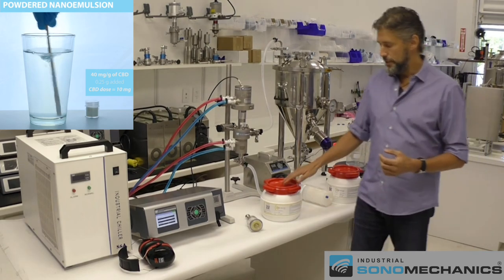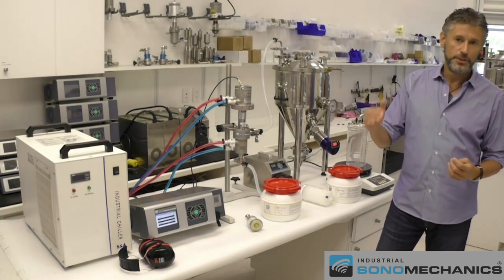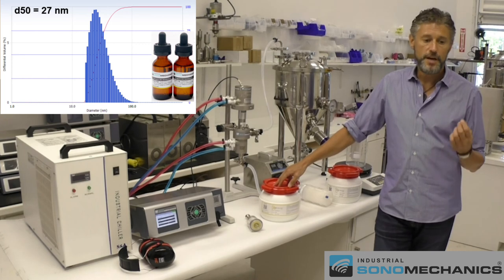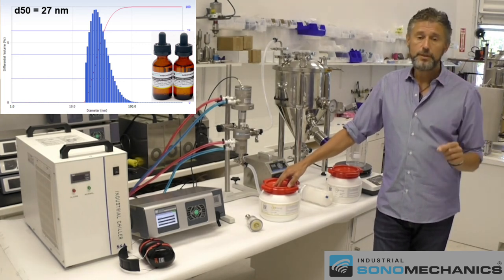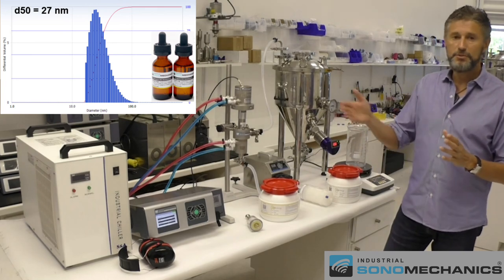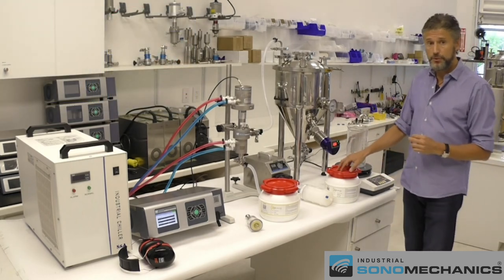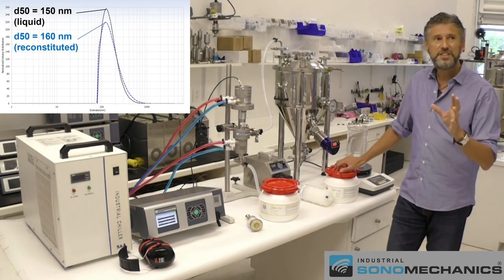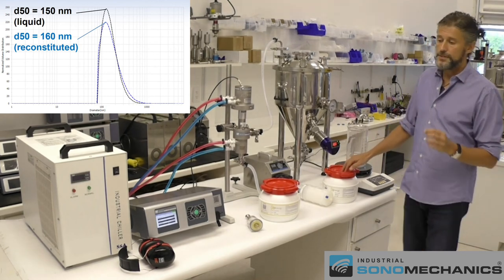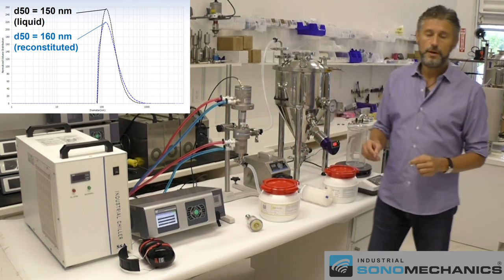It's also important to mention droplet sizes, as this is the main parameter that speaks to a nanoemulsion's quality, stability, bioavailability, and onset of action. Nanoemulsions made with Nanostabilizer LT — the translucent liquid ones — typically have median droplet sizes by volume distribution between 25 and 30 nanometers, which is responsible for their translucency and extremely high bioavailability. Nanostabilizer LSO nanoemulsions typically have droplet sizes of around 150 to 170 nanometers when first made. After drying, reconstitution into liquid, the droplet size goes up slightly but should remain under 200 nanometers, still a very high quality nanoemulsion.